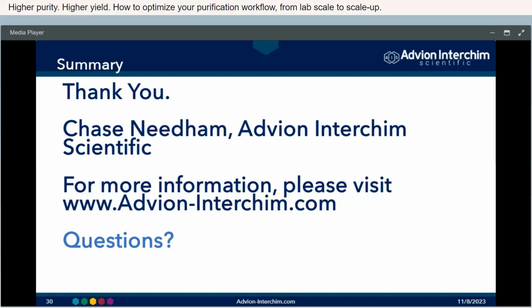But then you're also tightly constrained by how good your separation is on the TLC plate. If you have a very poor separation, you're generally going to need a larger column. And it really will depend on how many spots you are actually interested in purifying, how far those spots are away on the TLC plate, and then again, how much sample you have to purify.